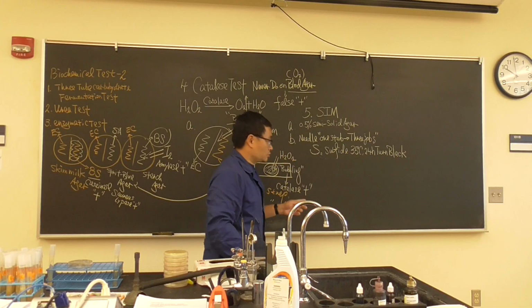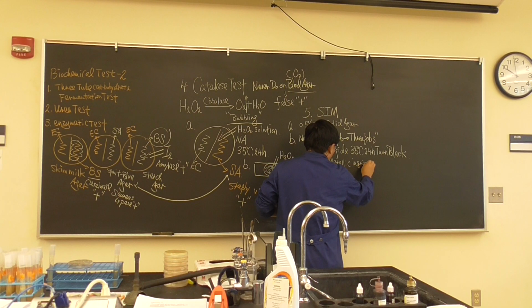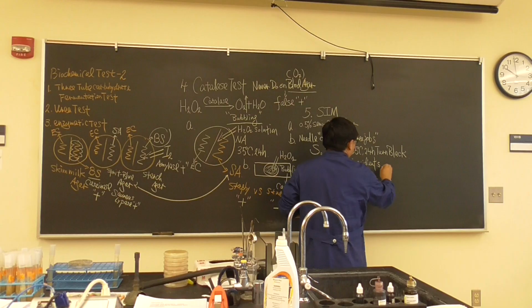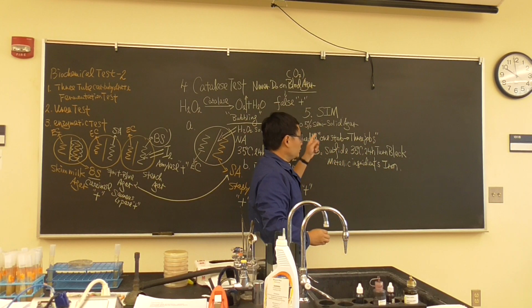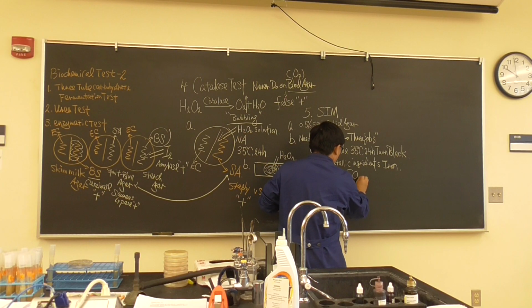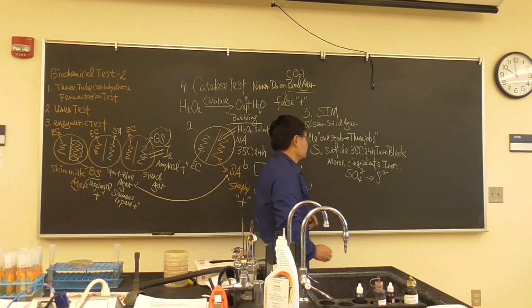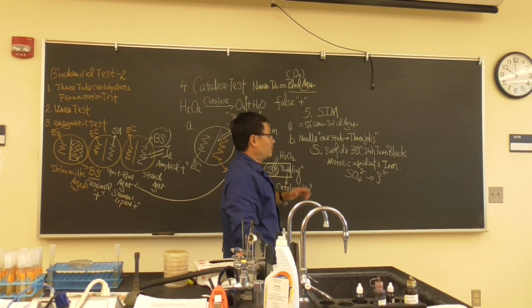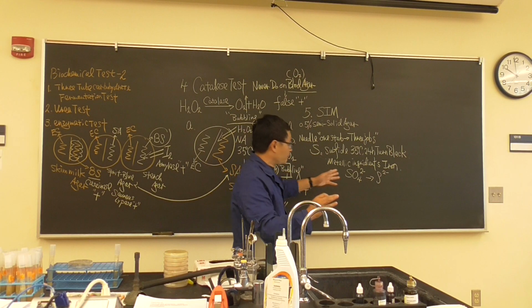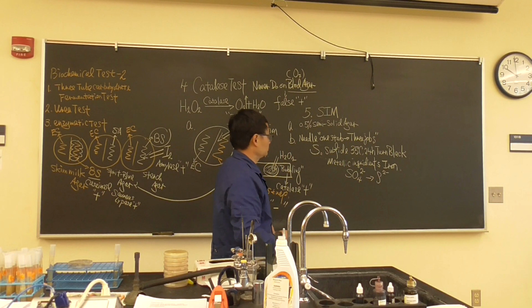The reason is there are metallic ingredients such as iron in this agar. And once they reduce sulfur to sulfide, they will show black color. But the black color will be gone because finally it will be reduced back. Okay, so it turns black.